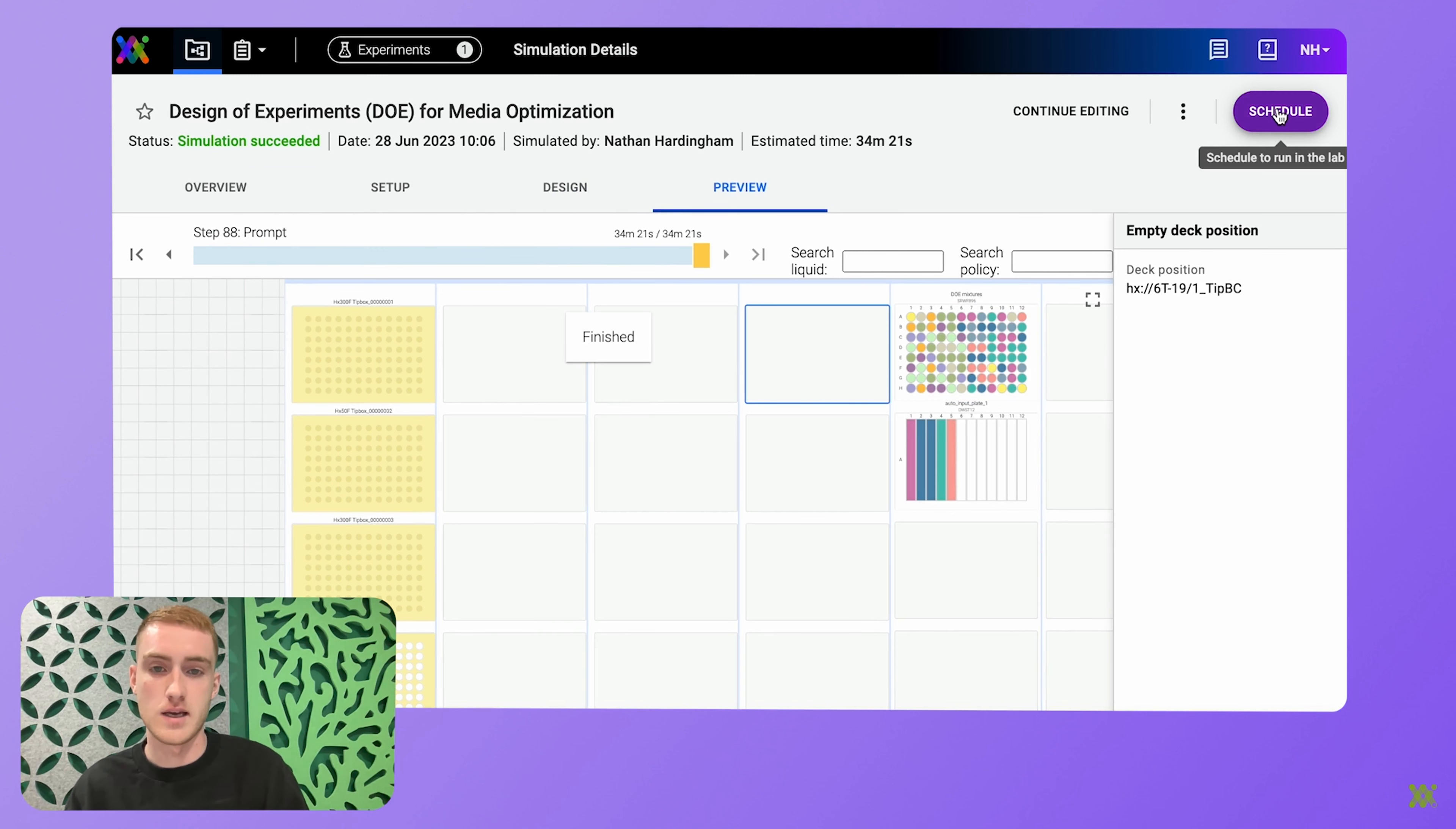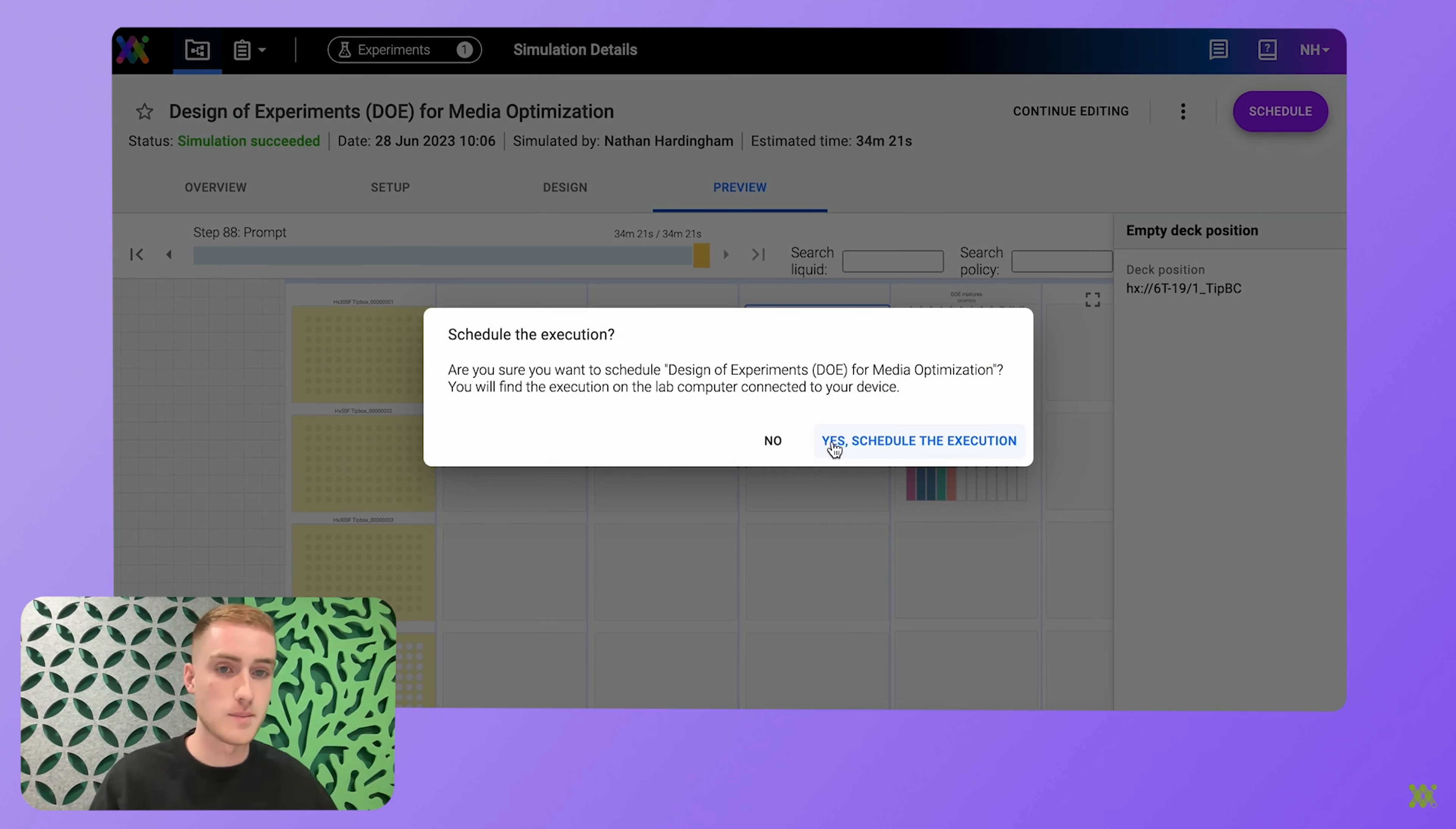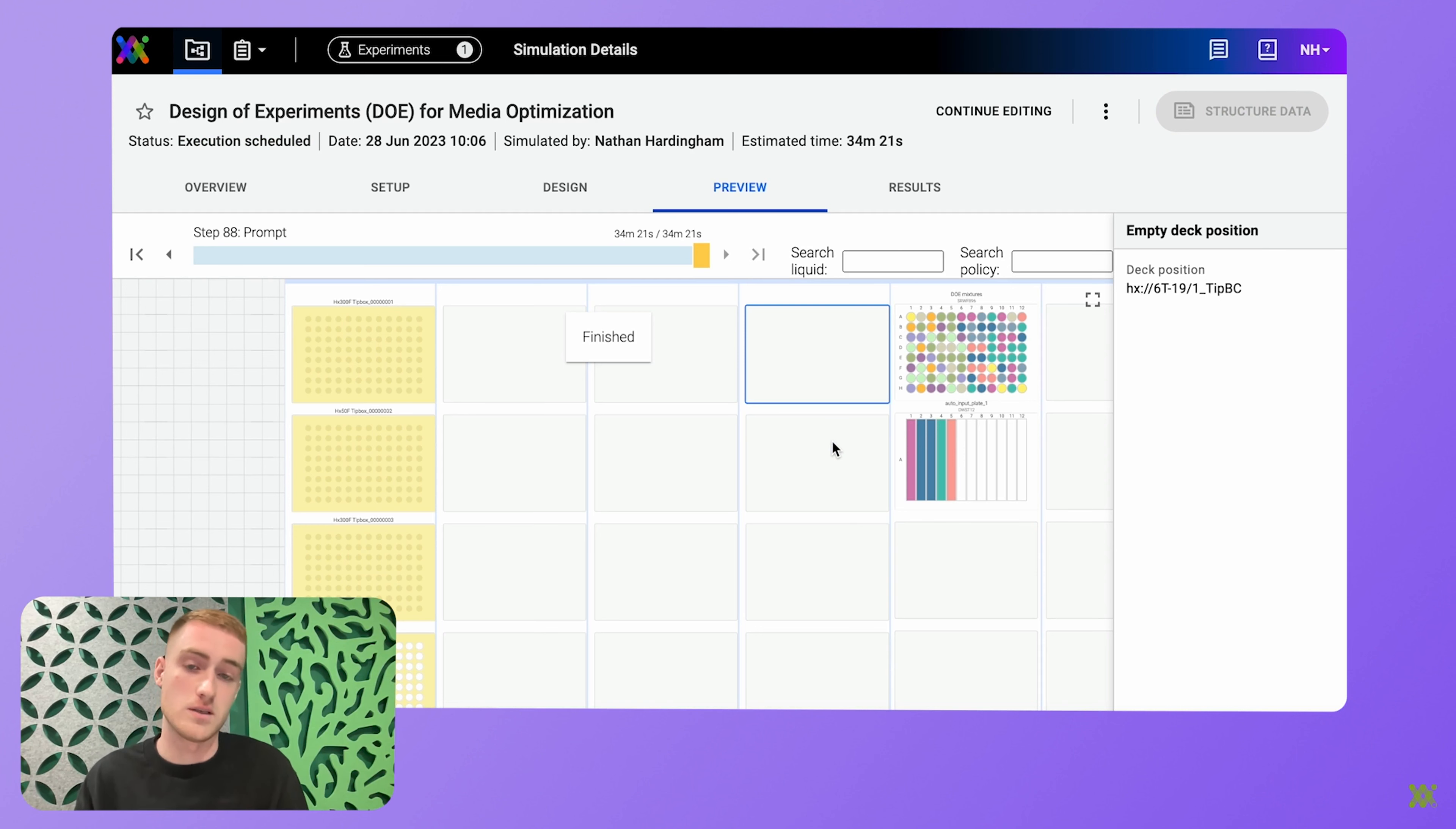And then with a couple more clicks, I'm sending that simulation to the lab. And then all you've got to do is set up your robot and press run.